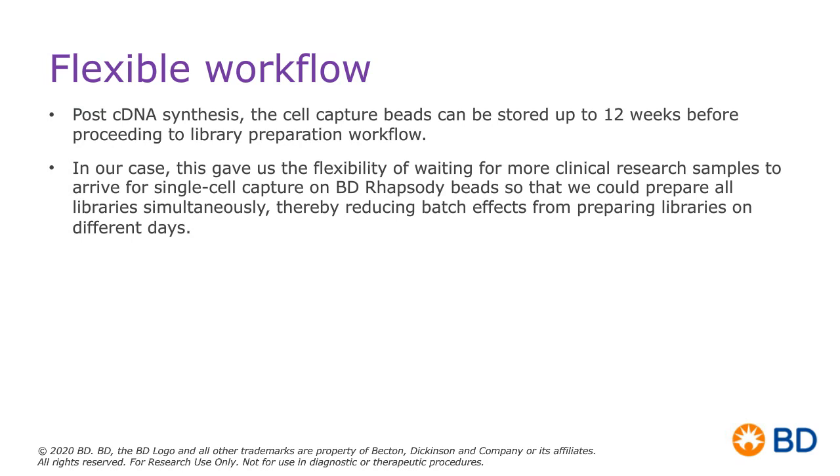Since we decided to capture our mRNA and our AB oligos on beads, we can do cDNA synthesis directly on those beads once we recover them. So basically, think about each bead now equaling a cell. We can store these beads, essentially the equivalent of the cell's mRNA and protein, for up to 12 weeks before we proceed with our library preparation and workflow.